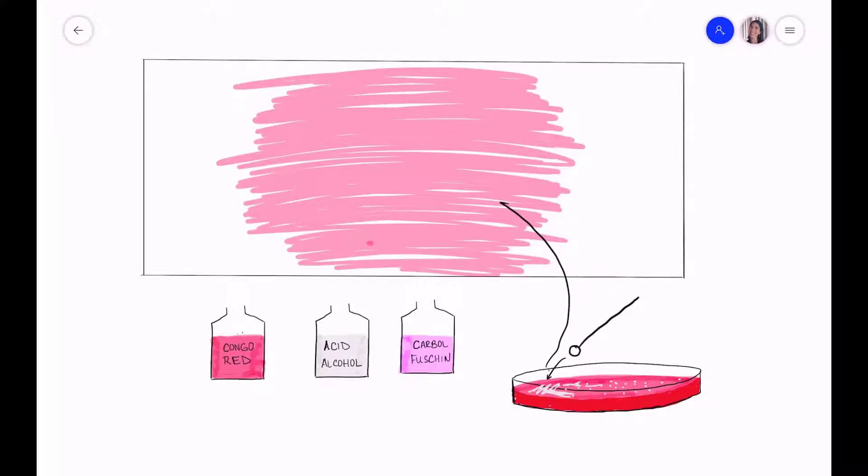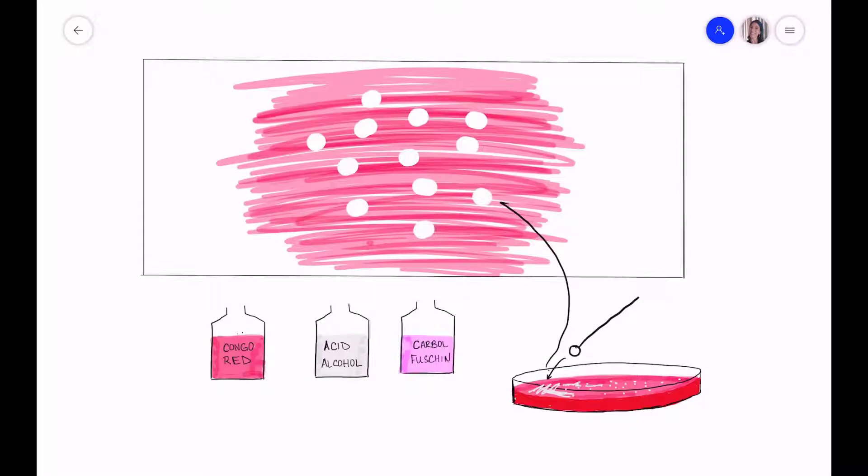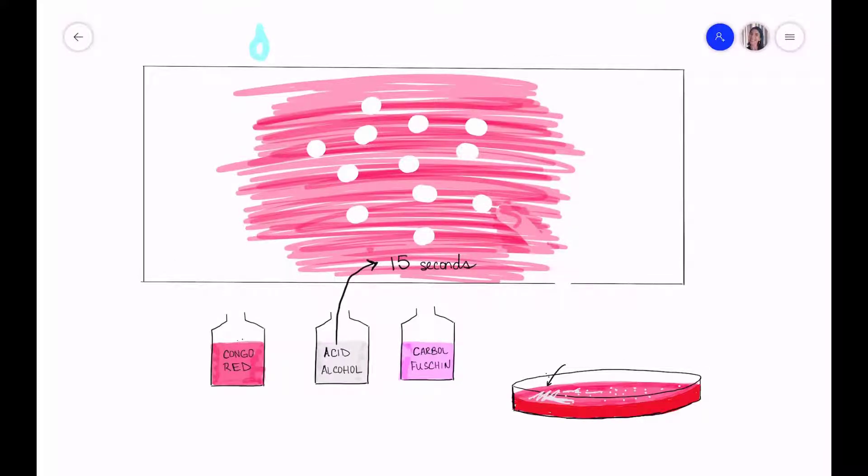If you were to look at the slide under a microscope at this point what you would see are white spaces where all the bacteria and their capsules are. So the next thing that we're going to do is add acid alcohol to the slide to fix it. What this does is create a tighter bond between the Congo Red, the cells, and the glass to kind of keep everything in its place. Once acid alcohol has sat on the slide for 15 seconds we can rinse it all off with water.